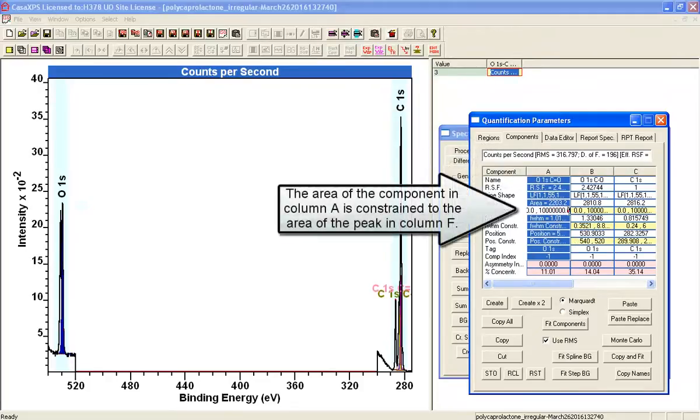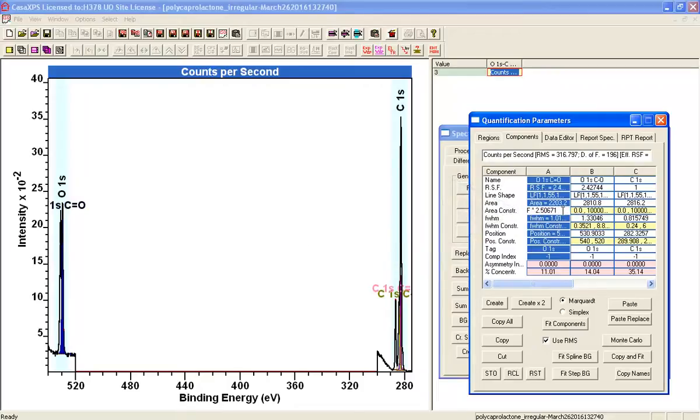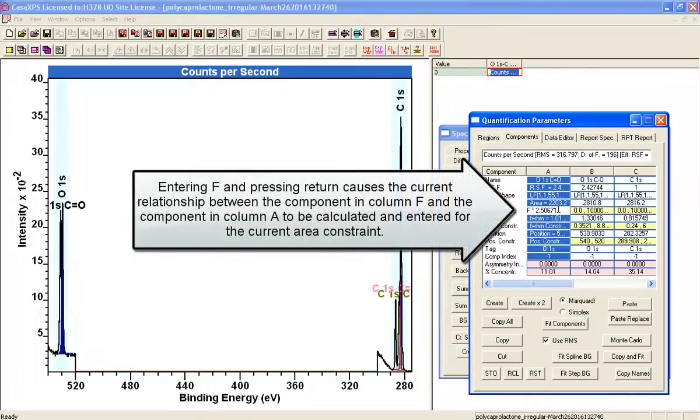If I now go in here and let's see how the parameter relates. If I type in F and press return, I get a value and the value has turned out to be 2.5.